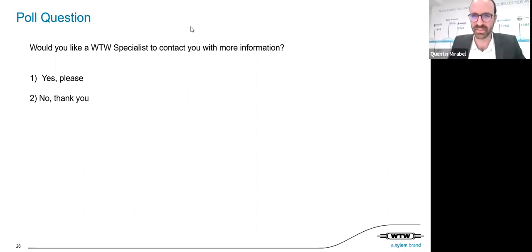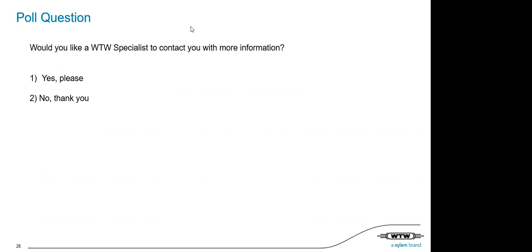Okay, another question. With the lab method for measuring BOD, what we call BOD5, how do you measure BOD with a sensor when BOD is based on change in oxygen concentration of a sample after 5 days incubation? Are you measuring organic carbon via UV and applying a calculation factor? Okay.